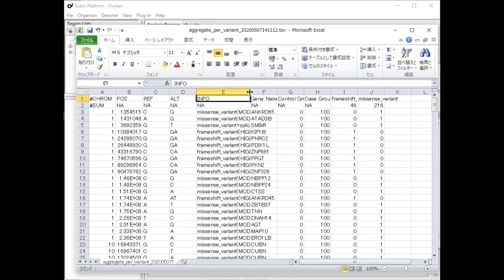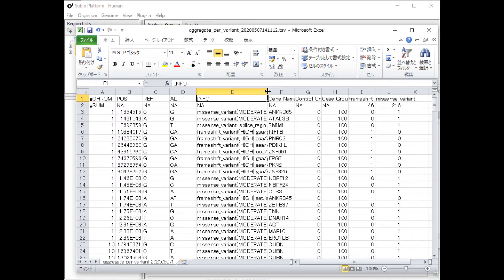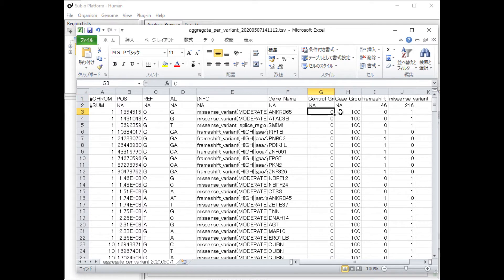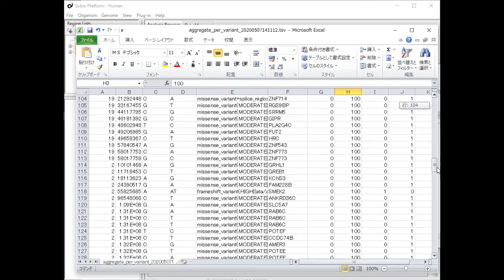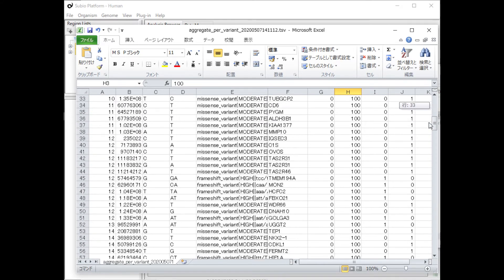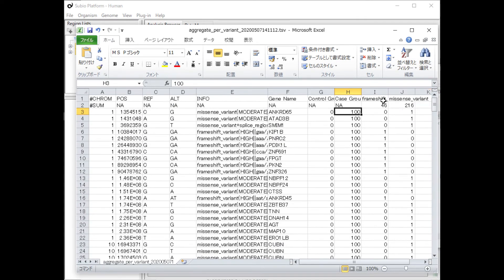The TSV file contains chromosome name, position, a nucleotide of the reference sequence and its alteration, annotation of the mutation, gene name, occurrence rate in control group, occurrence rate in case group, then there is a column for the Aggregate by Mutation type.